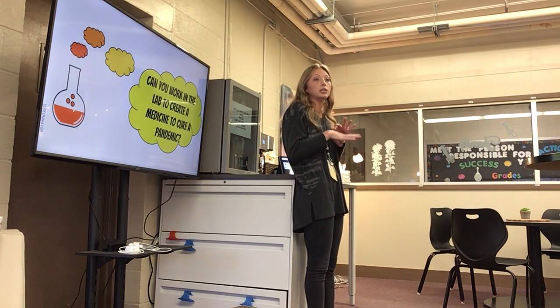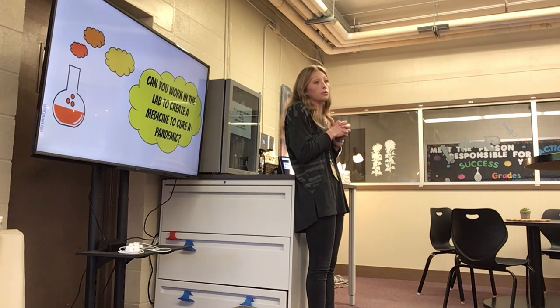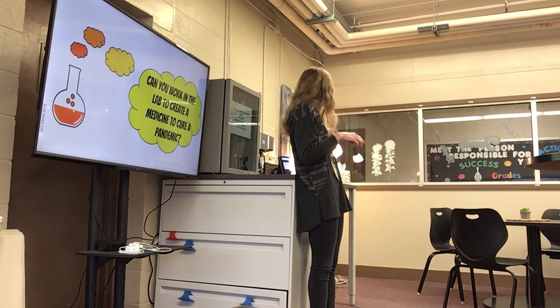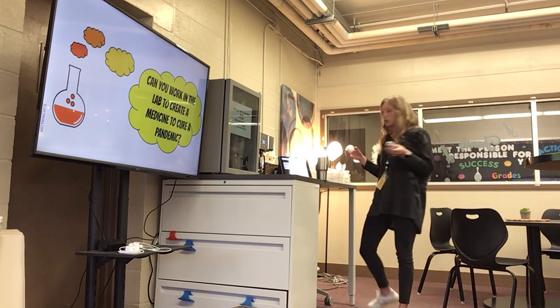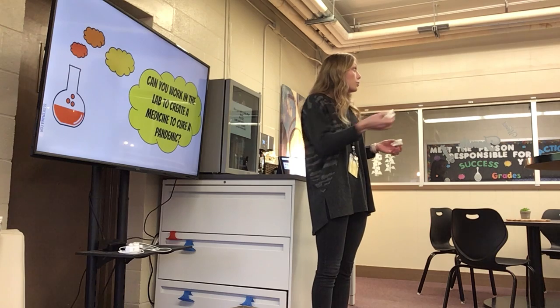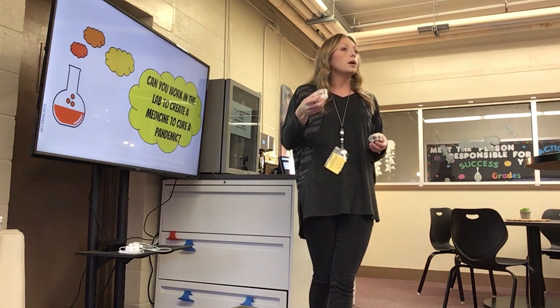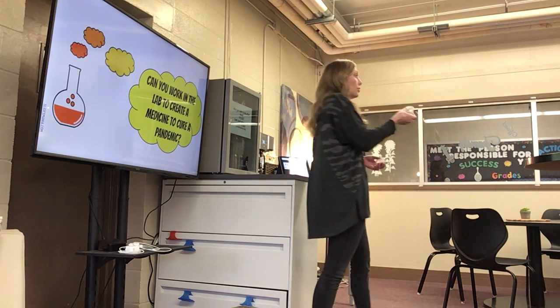This lab will be completely discovery. So you'll be working with your group, using research to obtain knowledge about mixtures, compounds, and solutions. So we're all going to be using table ingredients today. So you've all seen pepper, salt, sugar, right? Does anyone actually know what sugar is? No. So through research today, you're going to discover what is the chemical composition of sugar. You might be able to automatically relate it to a mixture, compound, and solution while you do your research.